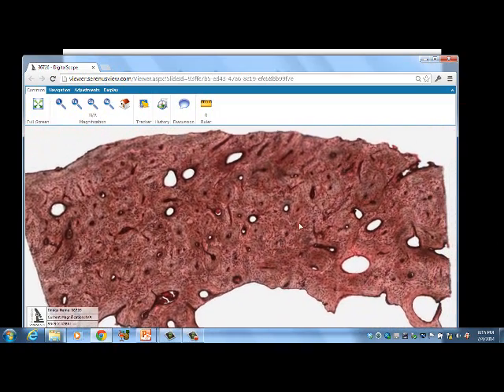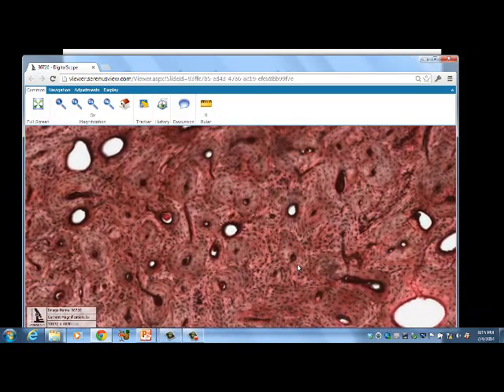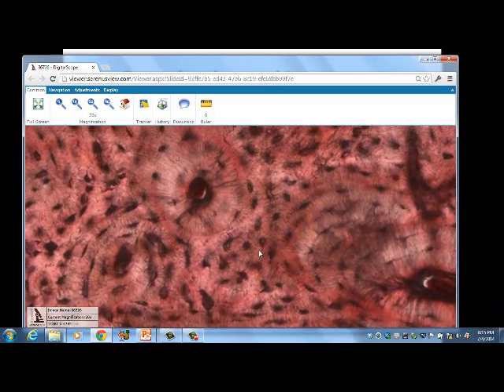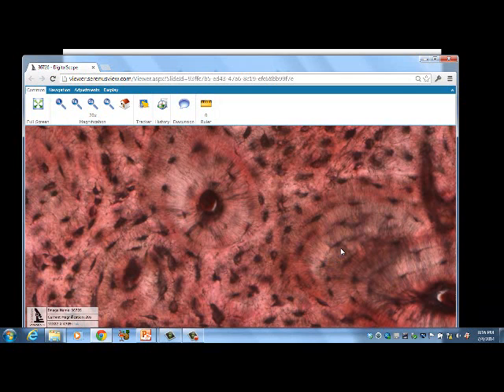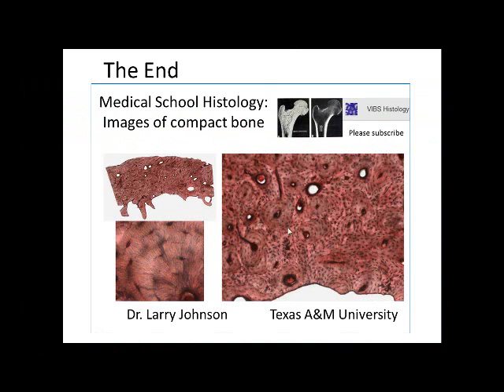That covers the basics of compact bone. We have the periosteum, endosteum, Haversian system, Haversian canal, and Volkmann's canal. The cells are: osteoblasts, which lay down new bone and become osteocytes when trapped in the matrix, and osteoclasts, which are large multinucleated cells that remodel bone by making holes. Compact bone and spongy bone together provide the structural support of the skeleton. Thank you.